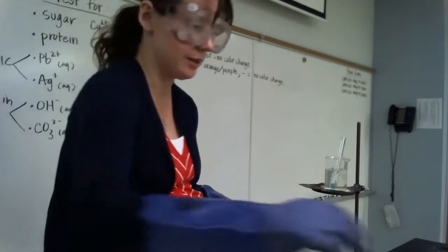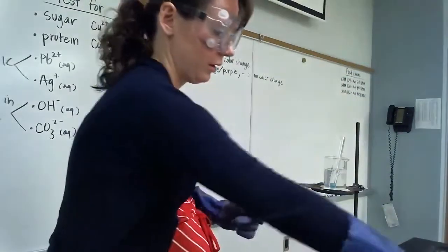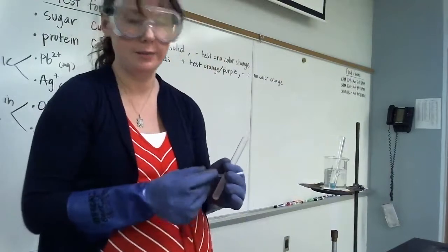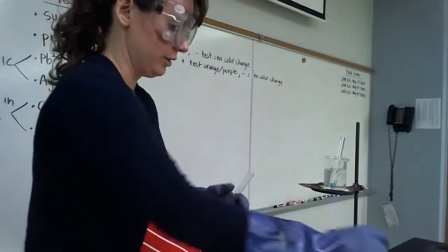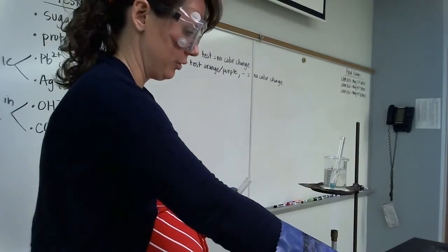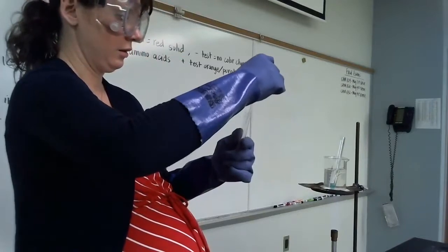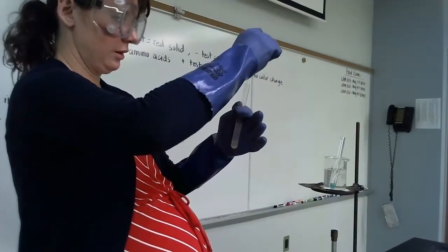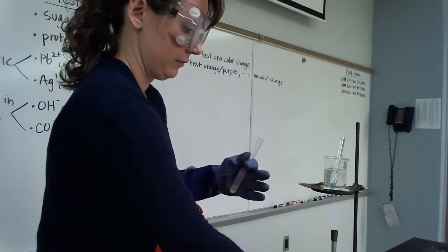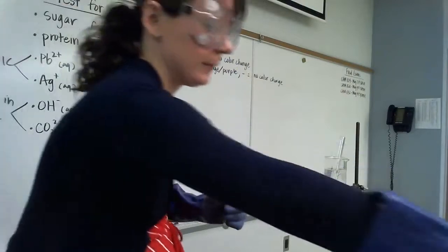Okay, let's do this now for our test for protein. And again, this needs to be heated. So we're going to do these two first so that they can heat while we do our other tests. So there's our sample. Again, there's the initial color of just the lake water.